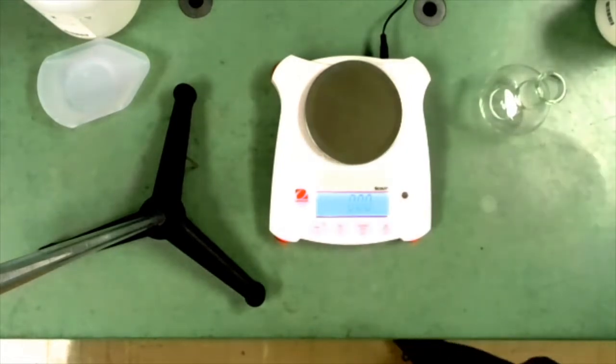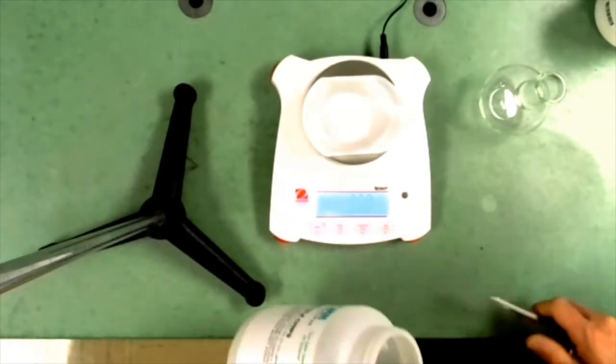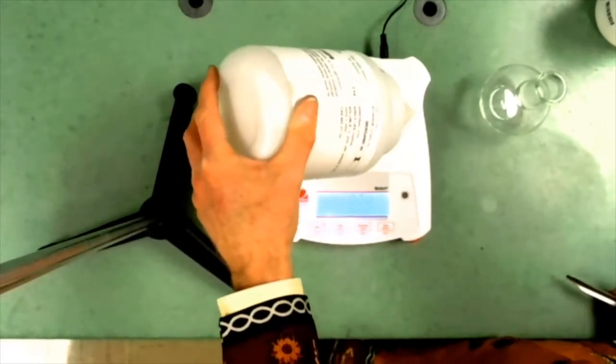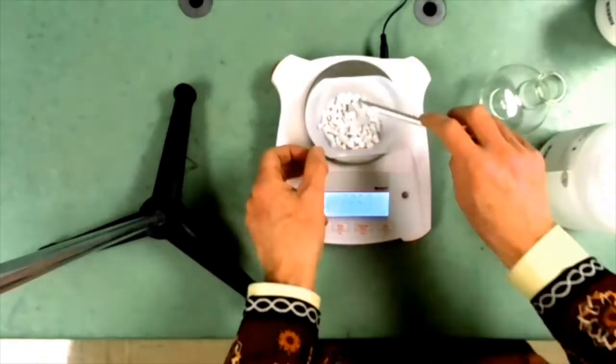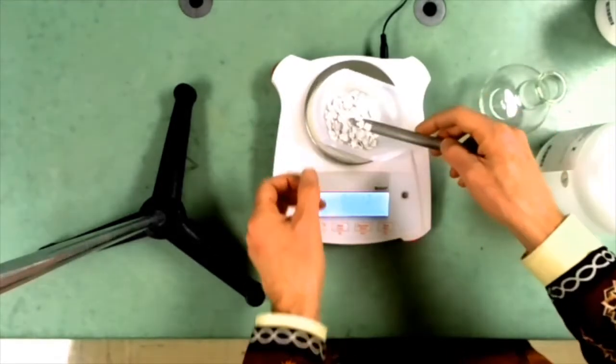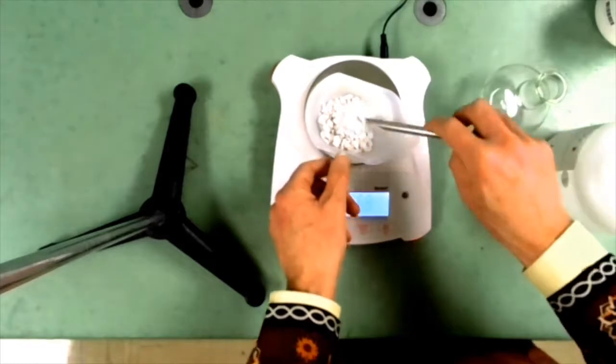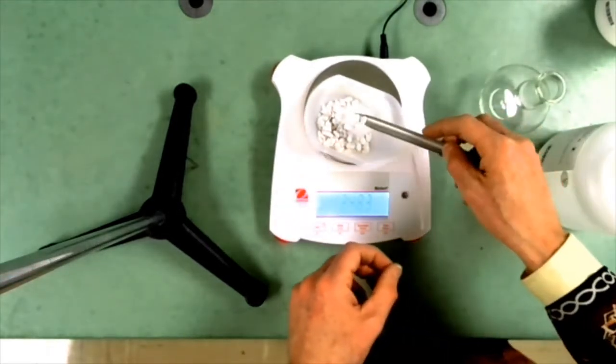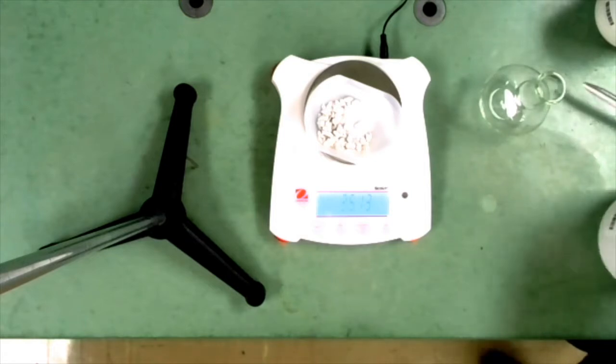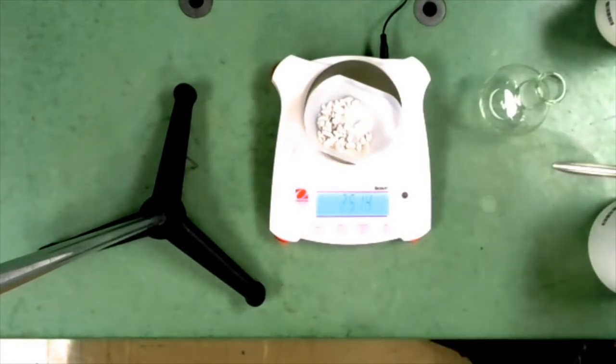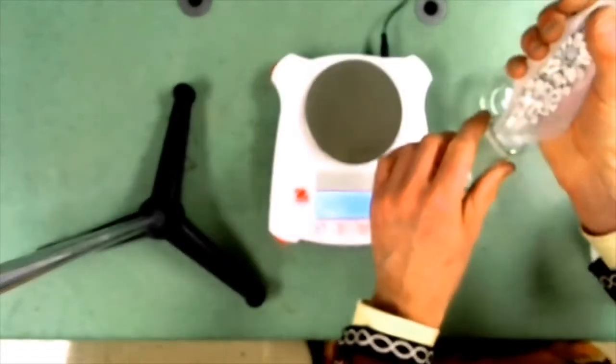Next we need to get some marble chips for the generating flask. Marble is calcium carbonate. We want 25 grams of marble chips. 27, pretty close, 26 and a half, 25.7, the exact amount here is really not critical. 24.8, 25.1, that's close enough for sure. I'm going to add that to the generating flask. The 25.14. I add the marble chips to the Florence flask that's going to be generating the gas.